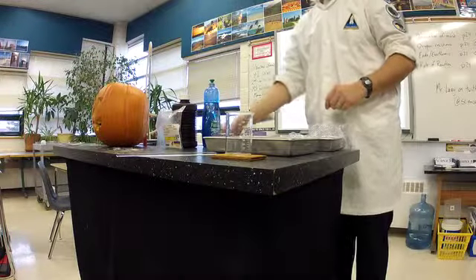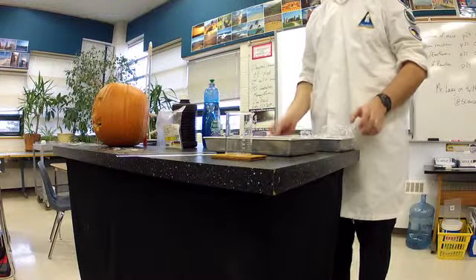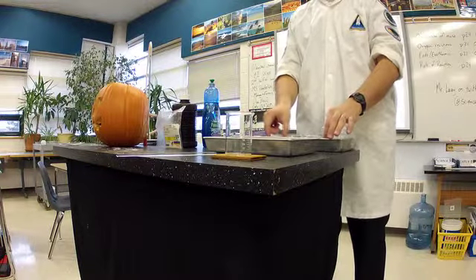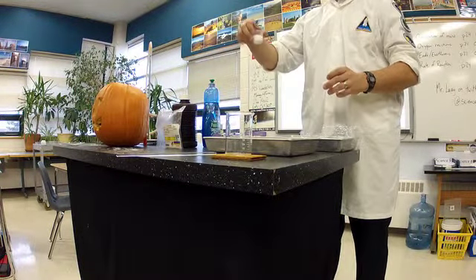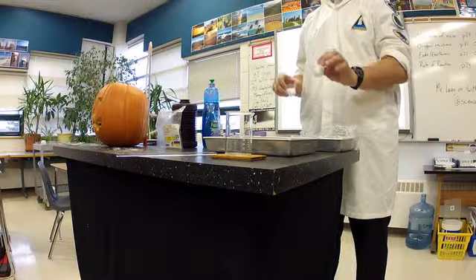Okay, so I'm going to demonstrate an endothermic reaction. I have two white powders. One is ammonium thiocyanate and the other one is barium hydroxide.